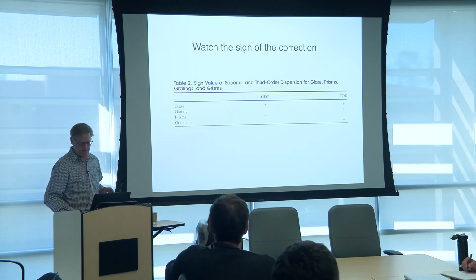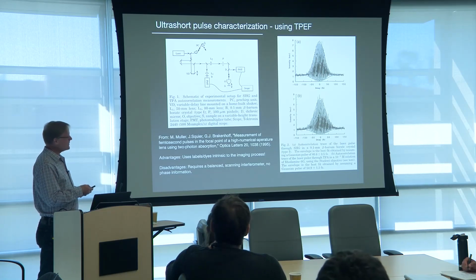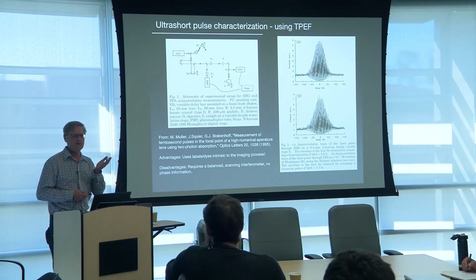So now how do we measure the pulses? This is kind of going back in time. One easy way to do it is to really just take advantage of whatever fluorophore you're using to label your system with.